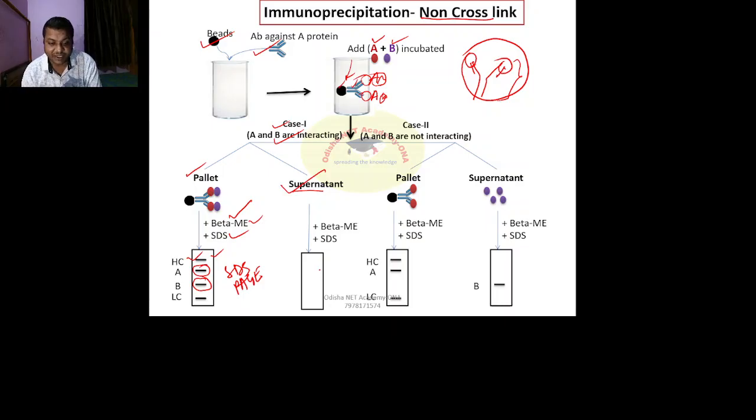SDS-PAGE, same treatment, and you are getting no band. No band means there is no free A and no free B. All the A and B are attached to each other and came to the pellet. So that also supports the result of the pellet side, meaning A and B are interacting.